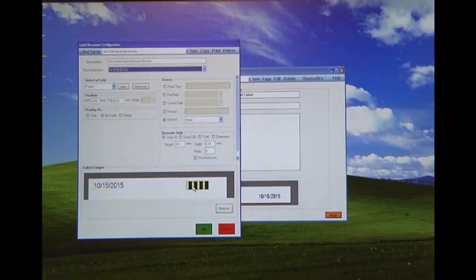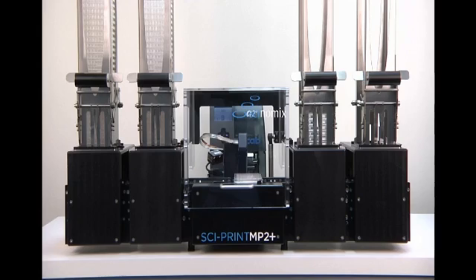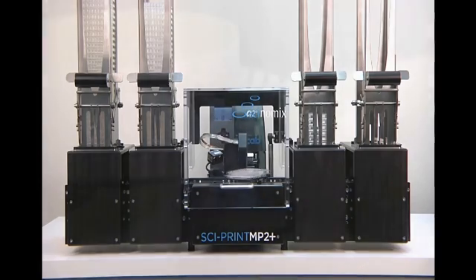Runs are recalled from a simple drop-down menu. Walk-away time for the MP2 Plus can be extended by adding additional stackers. Up to three input and three output stacks can be added, giving a total capacity of 150 microplates.